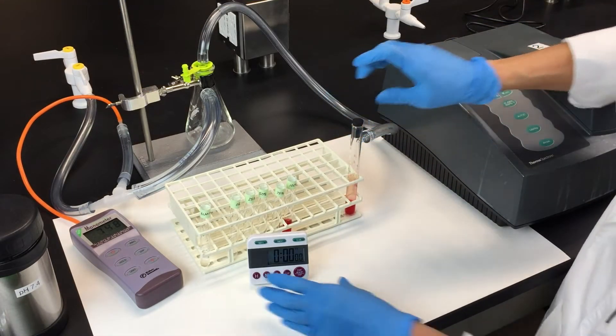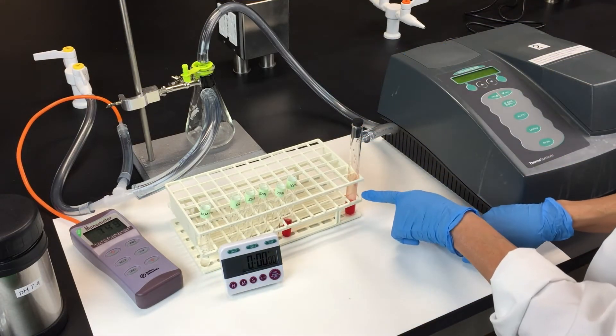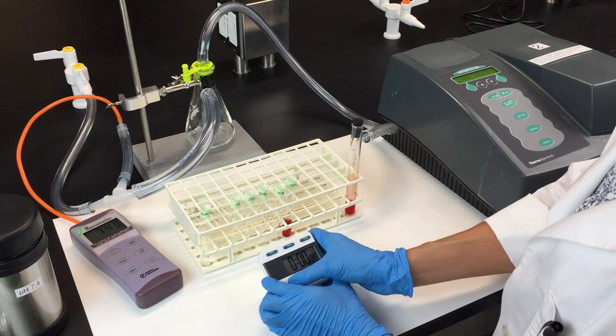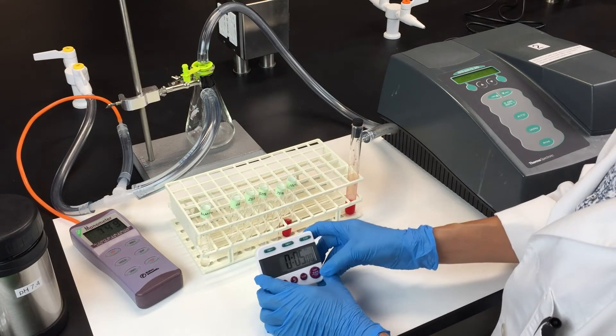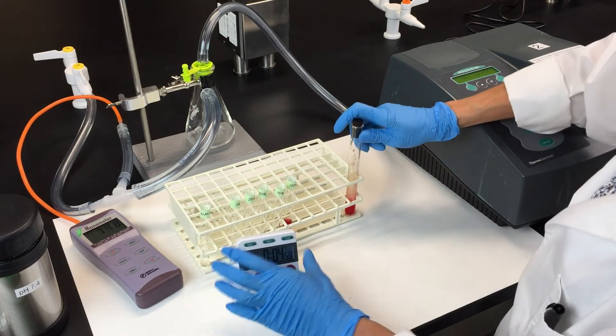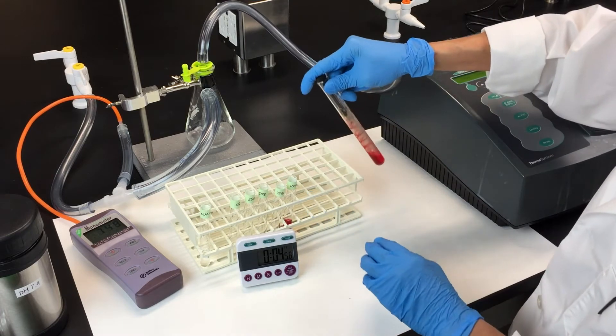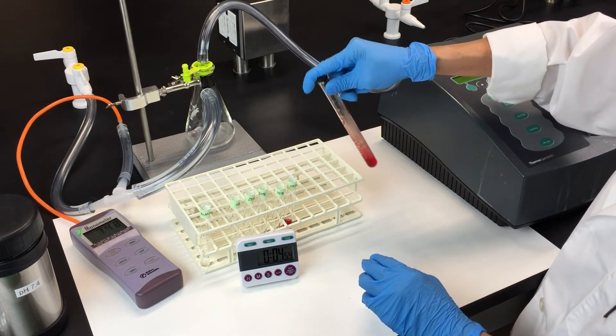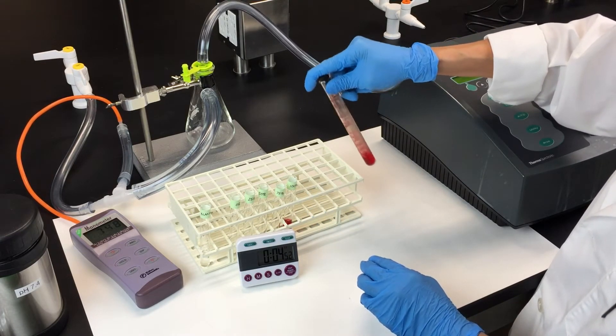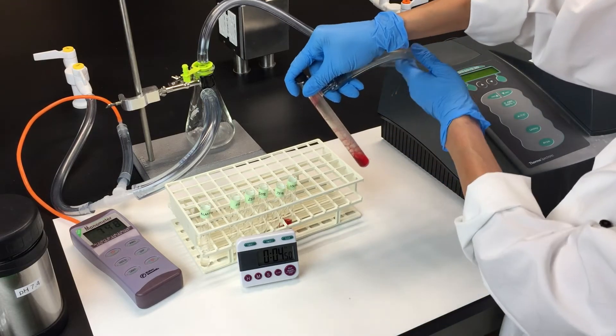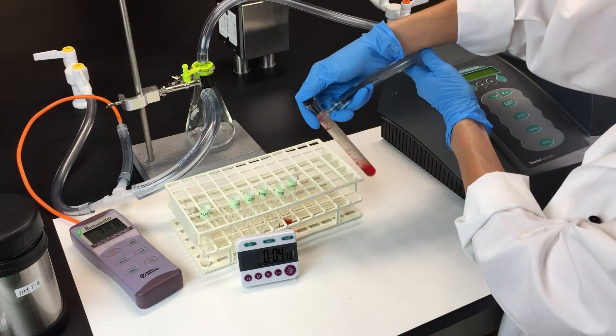This will cause the hemolysate to bubble up and jump in the tube. Set your timer for five minutes, then pick up the tube and shake it carefully. You want to keep it more upright because the high vacuum pressure will cause the hemolysate to bubble up quite a lot and you want to try and keep it out of the vacuum tubing.